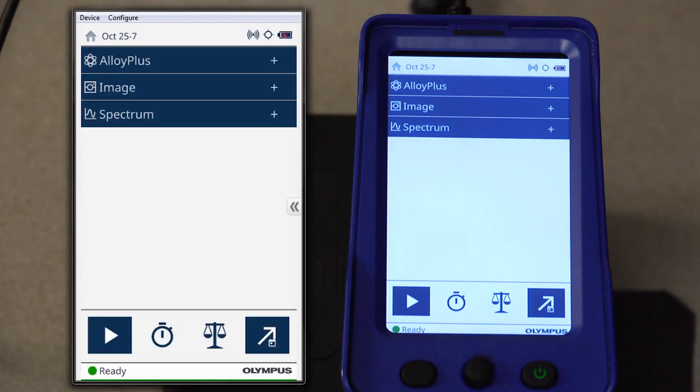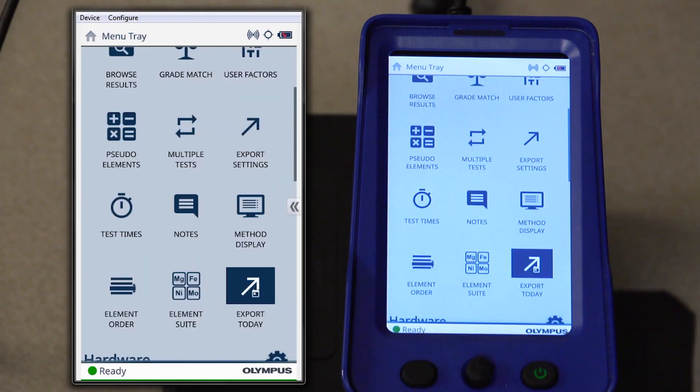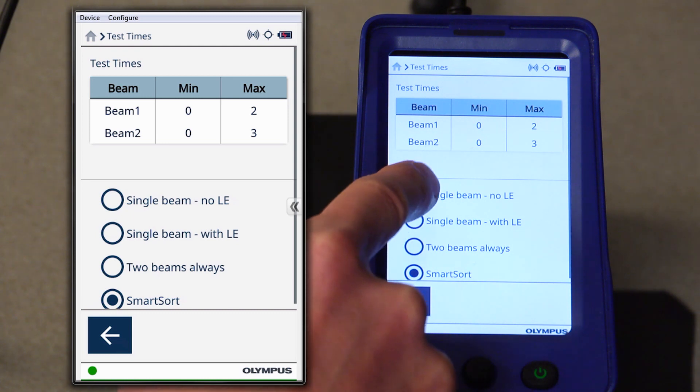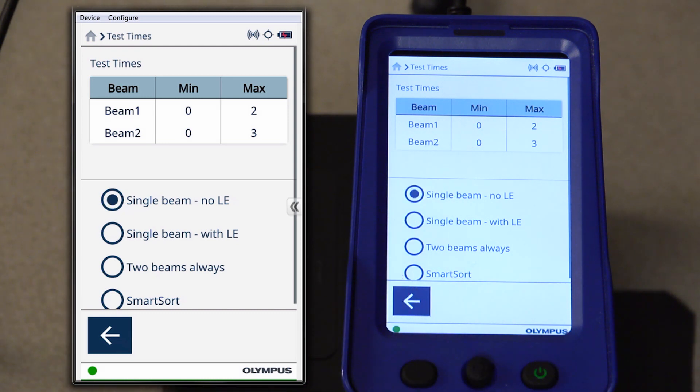In your alloy plus method on your instrument, you will want to set up test times by selecting the clock icon at the bottom of the screen or in the menu tray. In the test times screen, you will want to select single beam no-LE, and we select the no-LE selection because we want the instrument to not analyze and include the aluminum construction of the faceplate in the results.